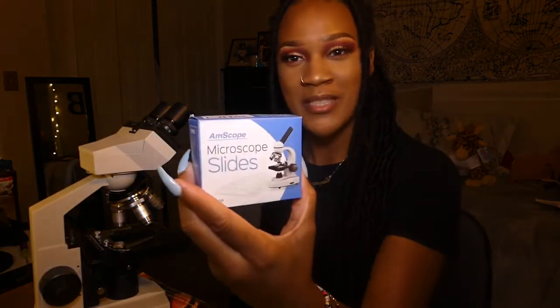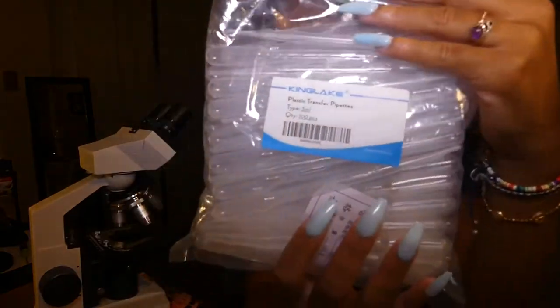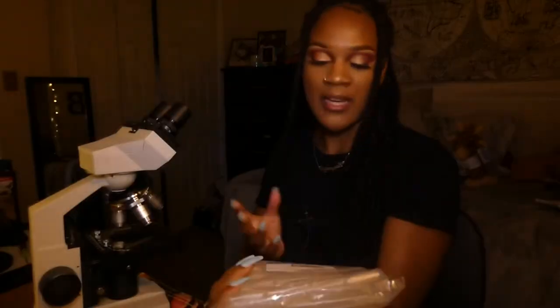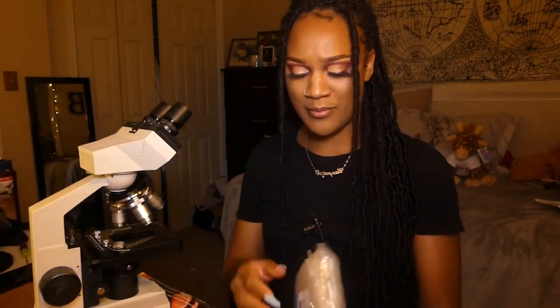I'm gonna get my slides, my AmScope slides. I have these plastic transfer pipettes. Got these from Amazon. I got everything from Amazon, pretty much. I'm trying to support black businesses, but you know.